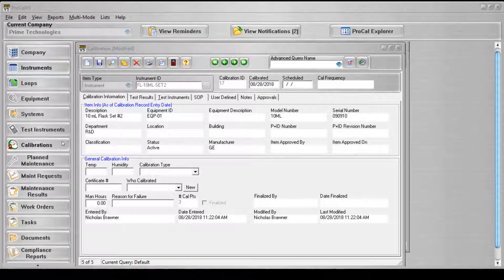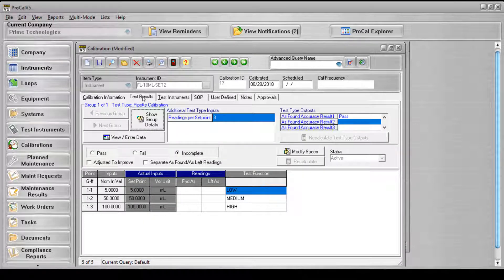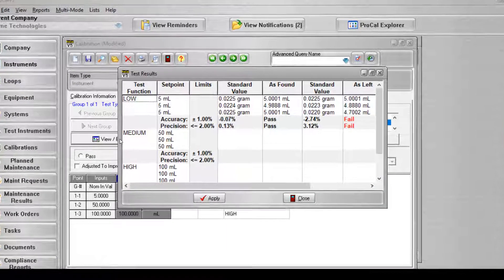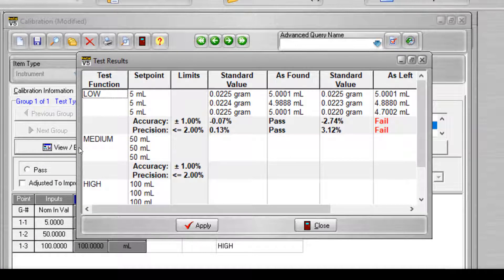Once a master record has been created for the pipette test type, the calibration data can be entered onto the test results tab of the calibration screen. Data for the test points will be entered by clicking the View Enter Data button. The test results grid shows the low portion already manually filled in, and the asLeft values have generated fail readings. After all the data is collected for a given set point, the precision, accuracy, and the result will be automatically calculated.